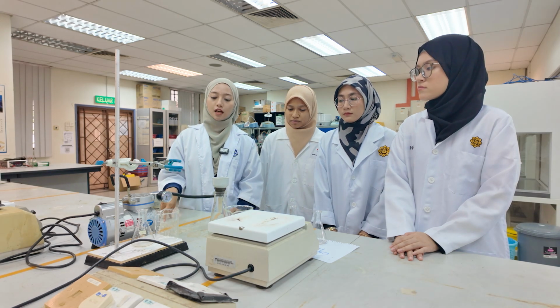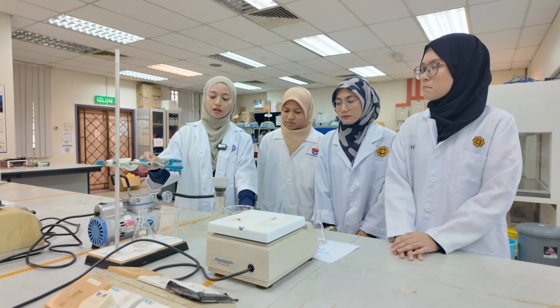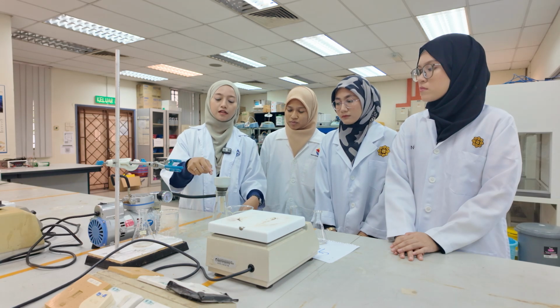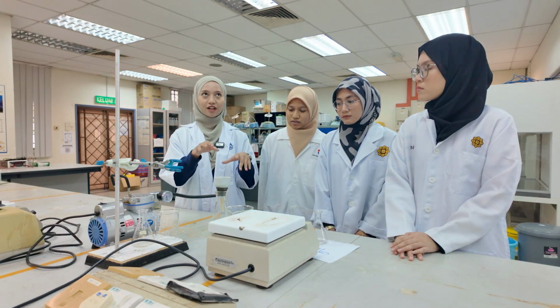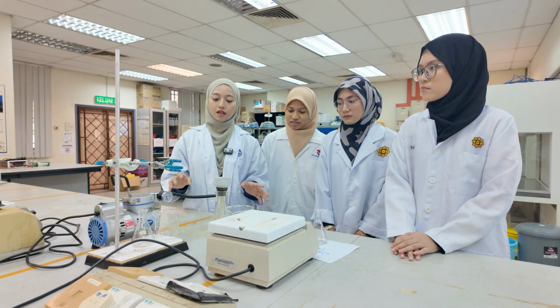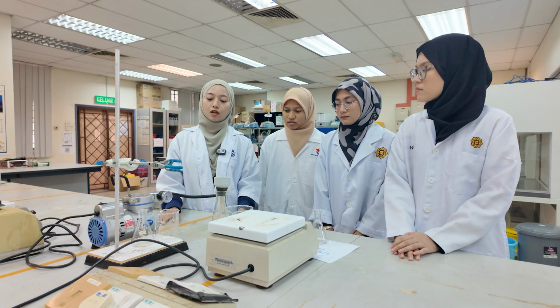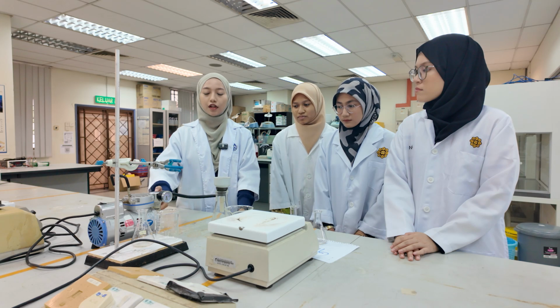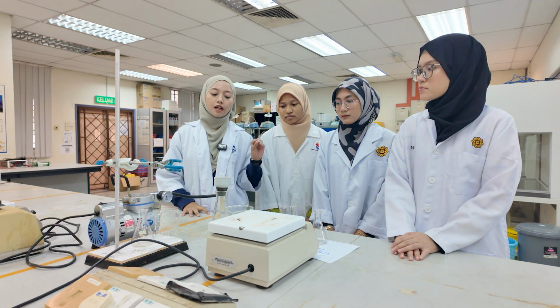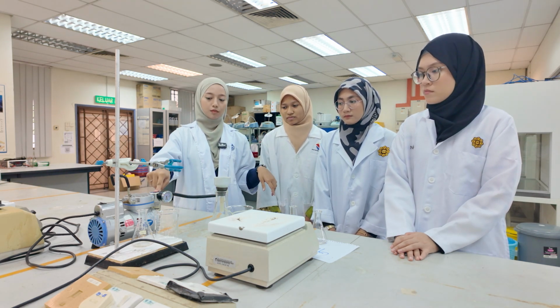We need to handle the vacuum filtration apparatus carefully. When we do not attach the vacuum pump properly to the flask, the flask might shatter and injure other people. So we must make sure that it is well secured, and also that the vacuum pump is functioning well, because some of the solvents and crystals might get sucked into the vacuum pump, so the pump can not be used anymore.